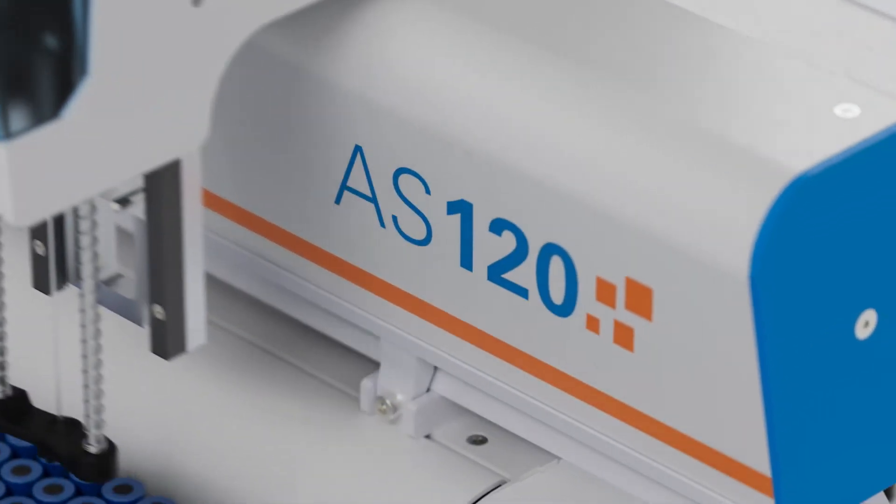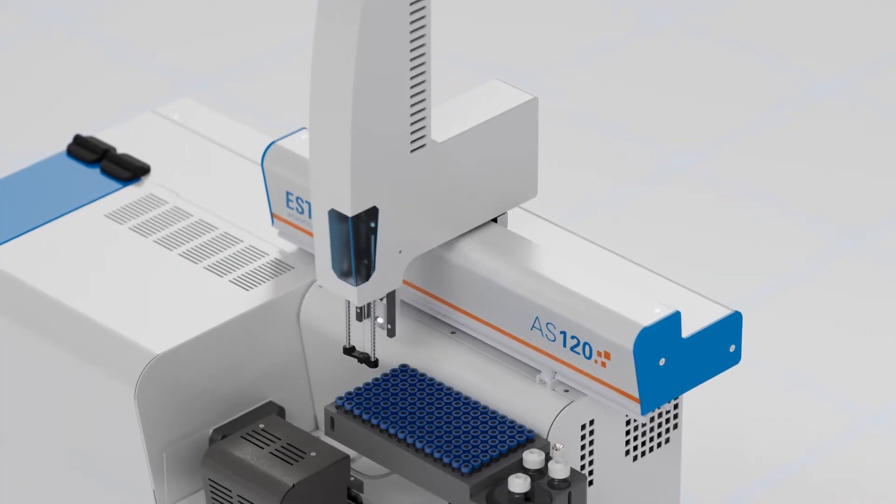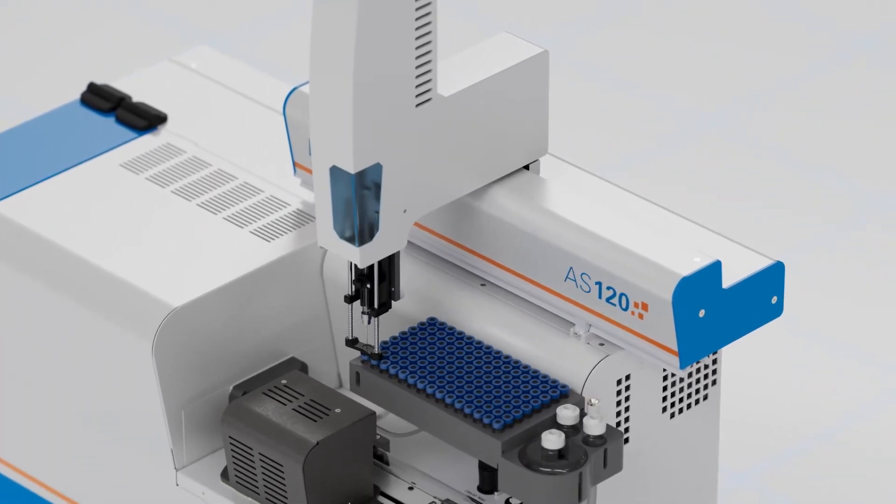The high-performance AS120 can handle liquid samples and can be converted into a solids auto sampler within seconds to deliver catalysts and polymers to the Nexus.